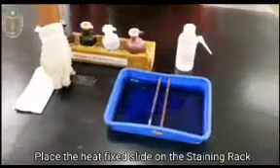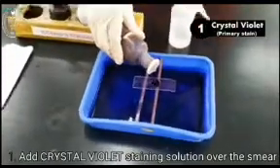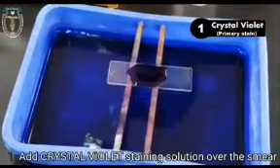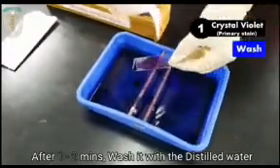Next step: we place the heat-fixed slide on the staining rack and add crystal violet, the primary stain. After leaving it for about 2 minutes, you wash off gently with distilled water.